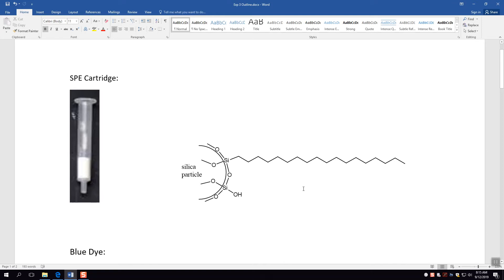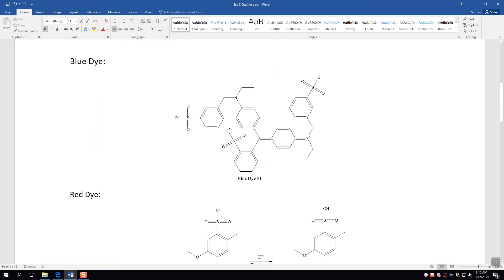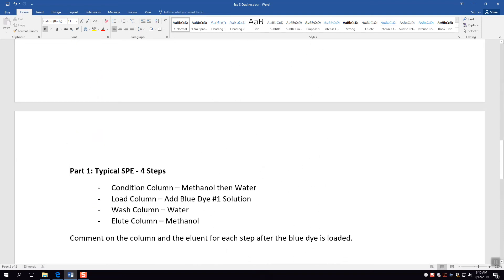You don't want to leave methanol in there, though, because if the C18 groups are interacting strongly with methanol — which although it's a relatively polar solvent, it's still an organic solvent — then they're not going to be as able to catch this molecule. So first we add methanol, then we wash out the methanol with water. Methanol activates these by spreading out the C18 groups. Water then gets rid of the methanol so that the C18 groups are not going to have strong interactions, because water is a very polar solvent.